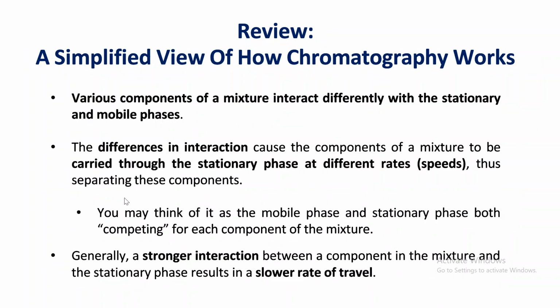Now, let's talk about a simplified view of how this chromatography is going to work before we show you an experimental video. As we know, various components of a mixture are going to interact differently with the stationary and mobile phase. We've seen that last time, and this is based on intermolecular forces of attraction.